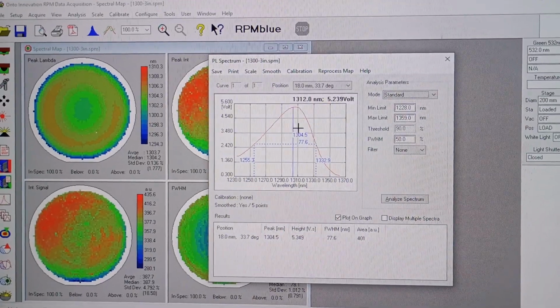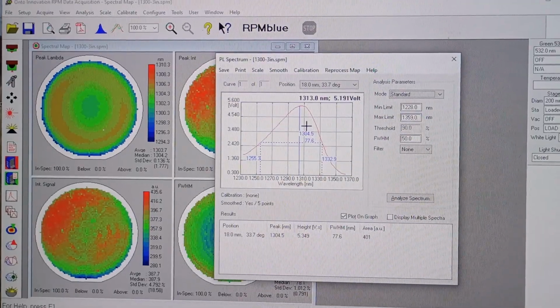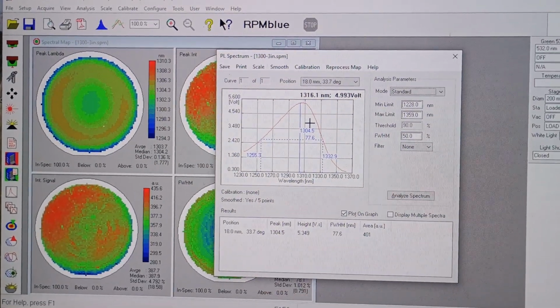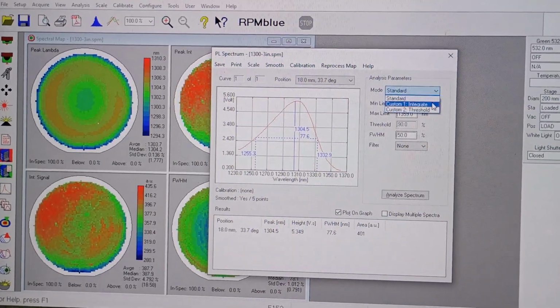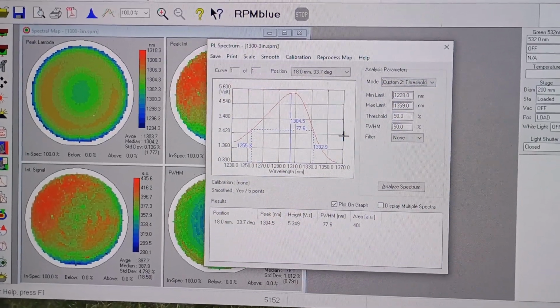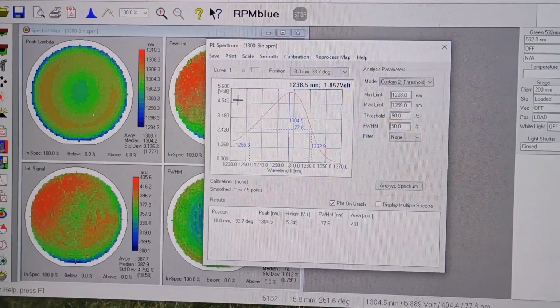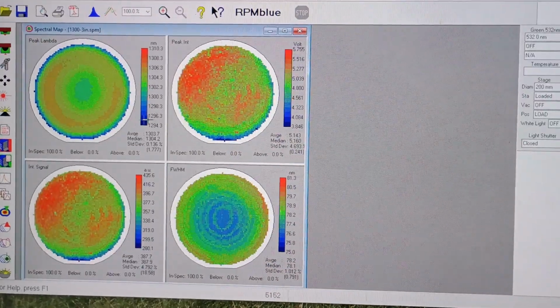So in that case, the only allowable values are roughly every 1 nanometer. And you can see it's indicating where my cursor is at each point there. In the threshold analysis, I'll get a continuum. So there are data values allowed between the bins.